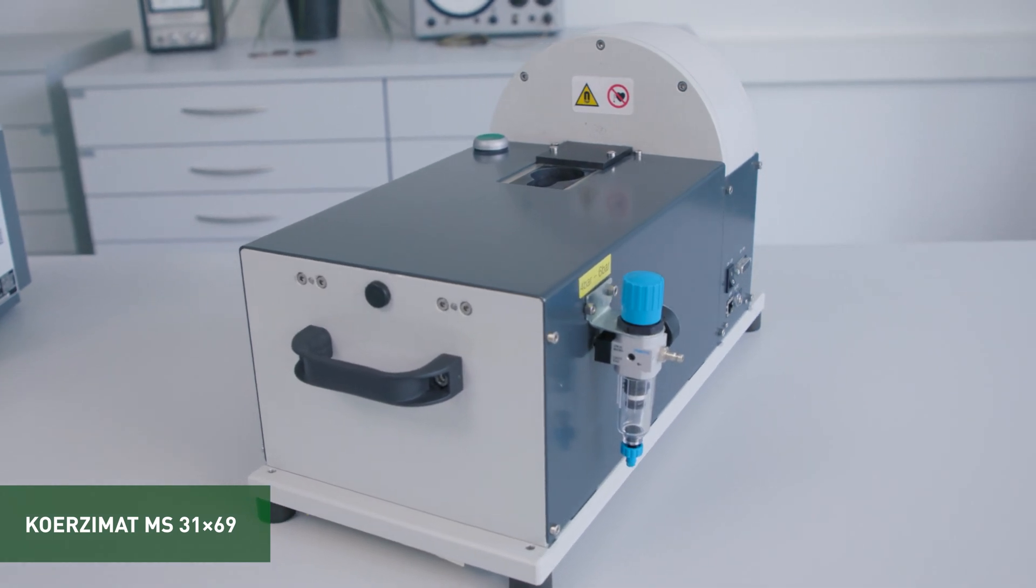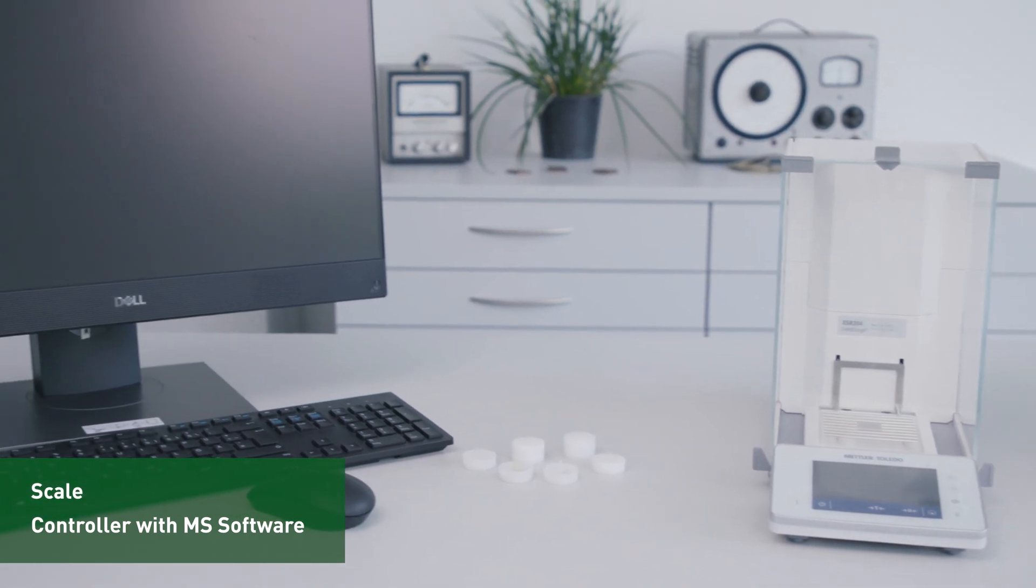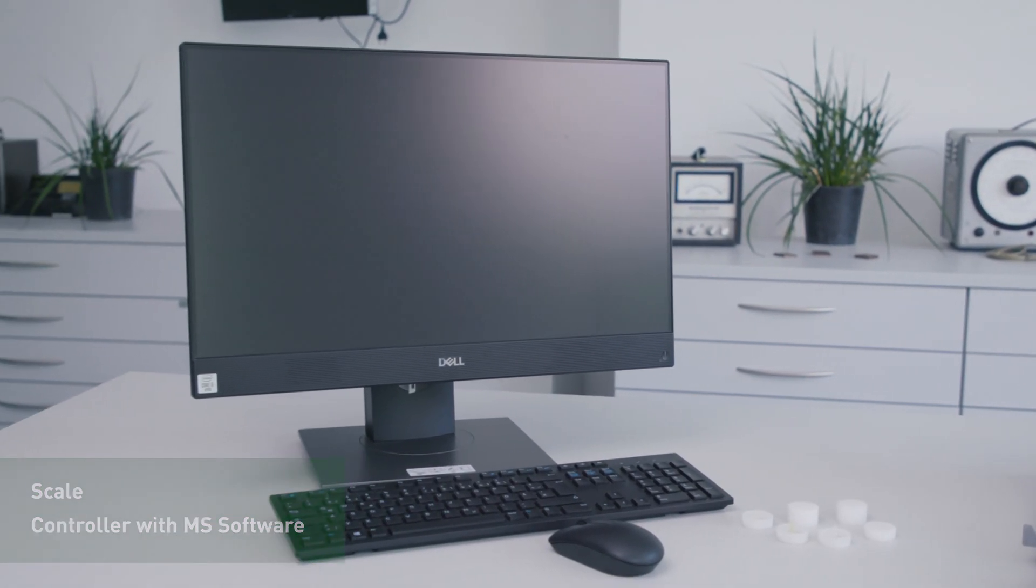The Corzomat package also includes a scale for determination of weight or density, a Corzomat controller with MS software, and a reference standard nickel.